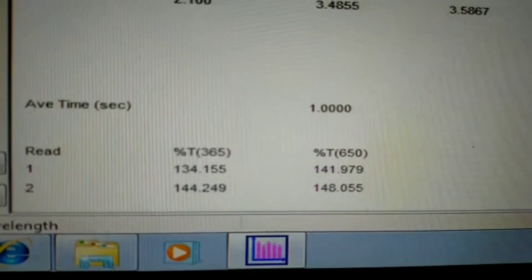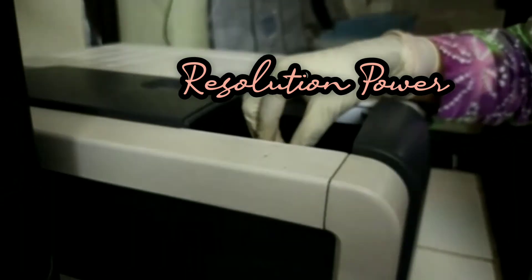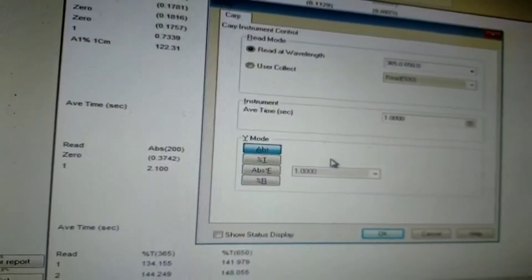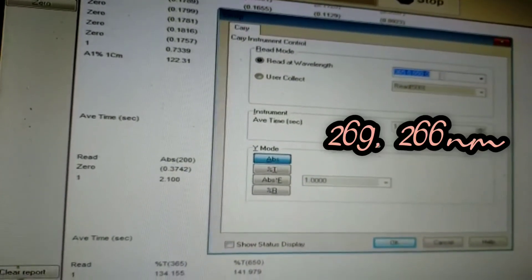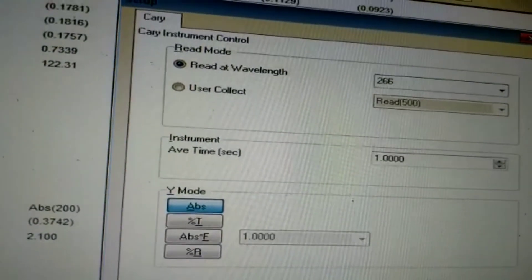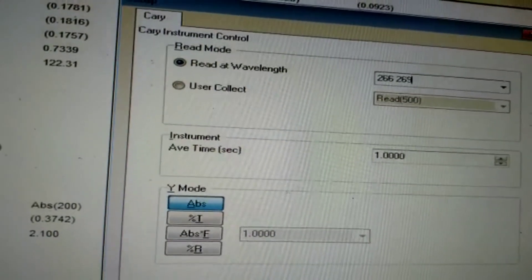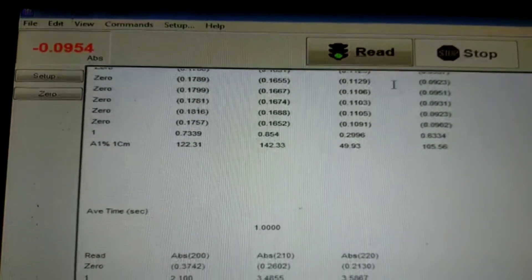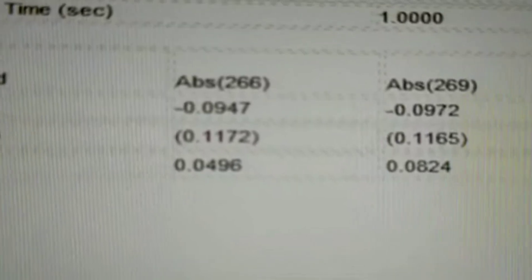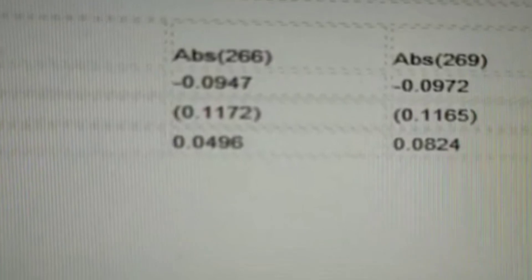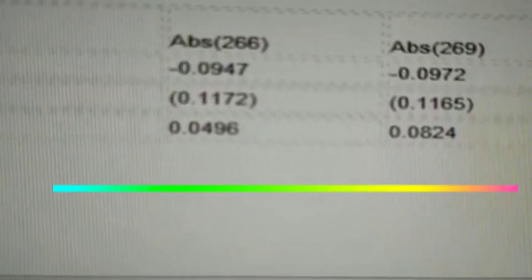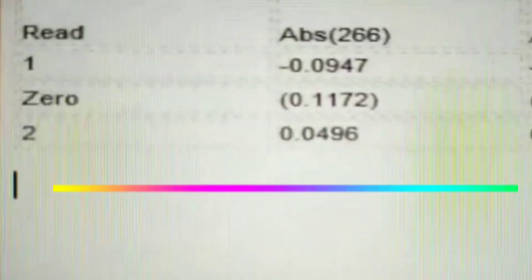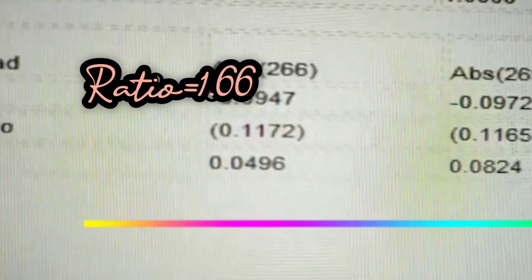Next I check the resolution power of the UV visible spectrophotometer using a 0.02% volume by volume solution of toluene in hexane, setting the wavelengths at 269 and 266 nanometers. We record the ratio of absorbance at the maximum (269 nm) to the minimum (266 nm). The values obtained are 0.0496 at 266 nanometers and 0.0824 at 269 nanometers. The ratio is 1.66, which is not less than 1.5, so the acceptance criteria has been satisfied.